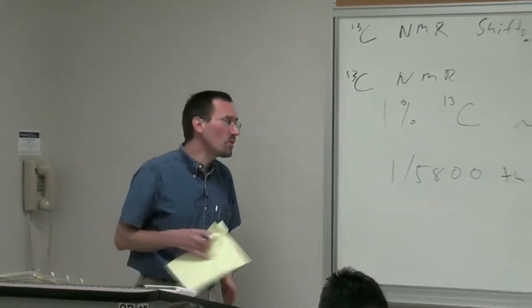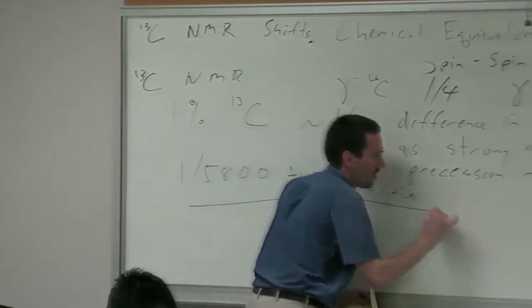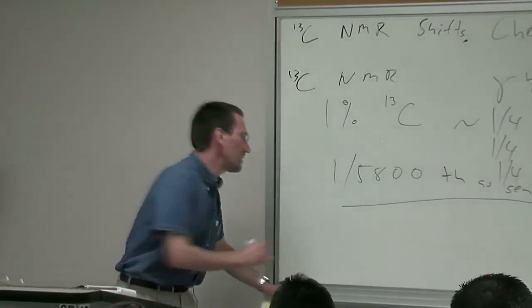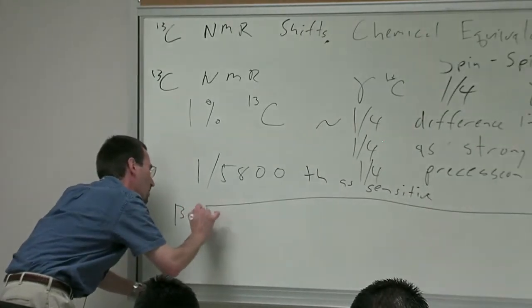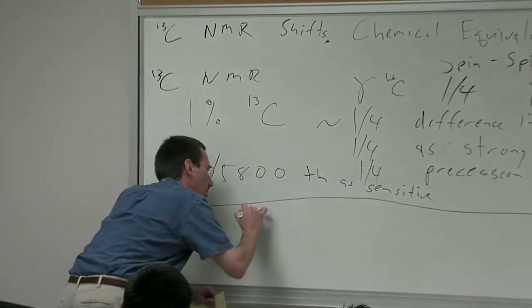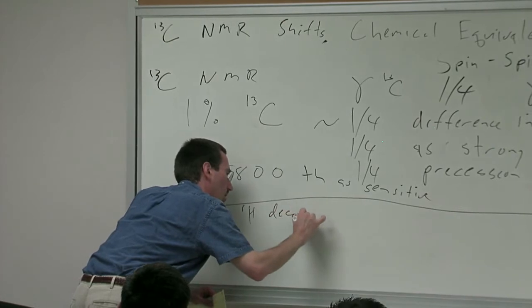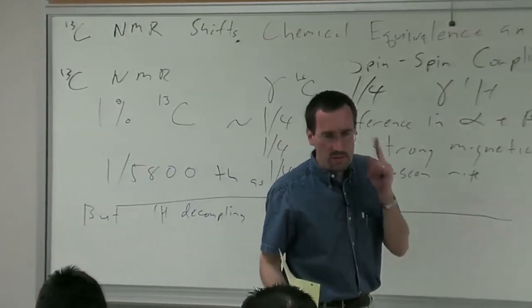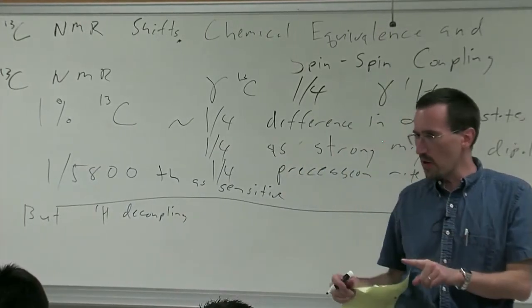Now, there are a few redeeming features. One thing that's redeeming is we typically do proton decoupling. Normally, a carbon would be split by all of the protons.